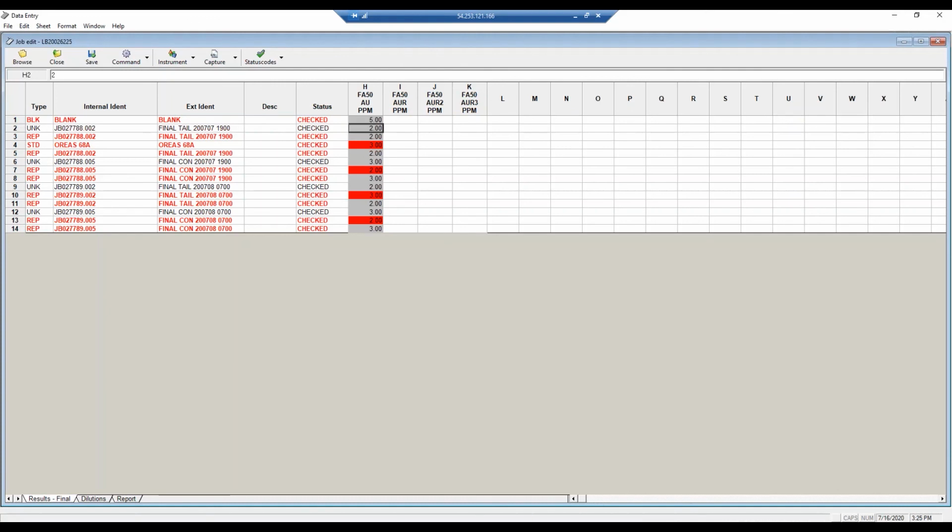Okay, so what we've got here, and remember this can be applied as a training course for every scheme in the system to individually control access and what level you can manipulate data inside CCLAS. So at the simplest level, it's just a way of keeping track of how we're going in terms of our training status. And it gets further into this where we're controlling the way CCLAS behaves. Okay, guys, I think that's probably as much as I can say about the training module.